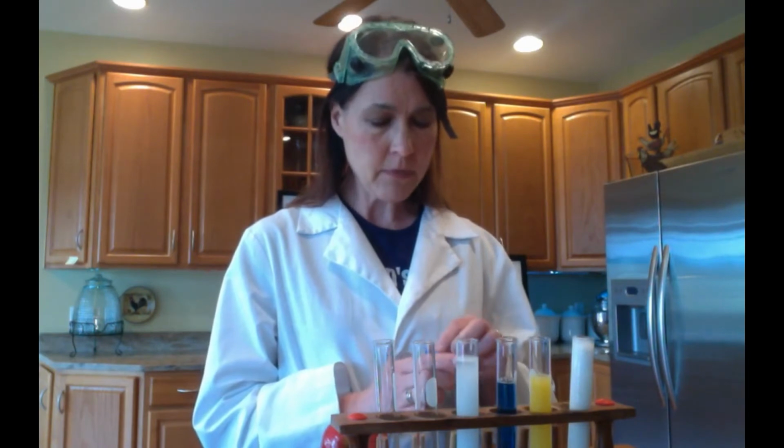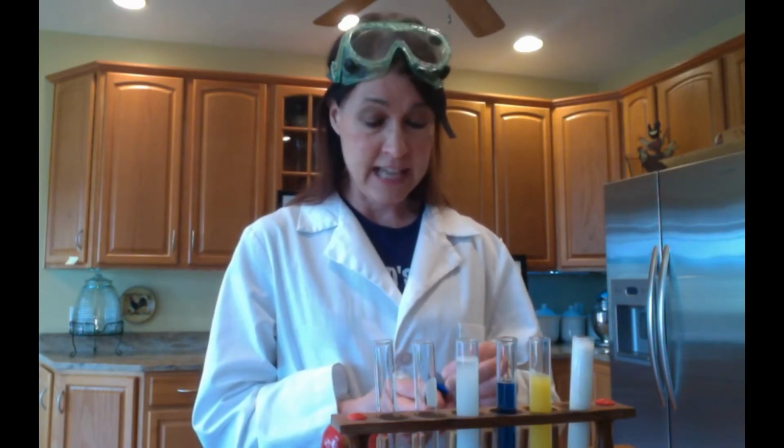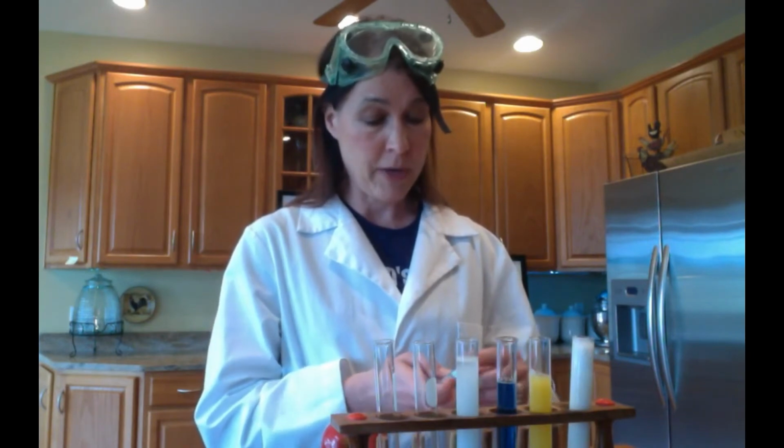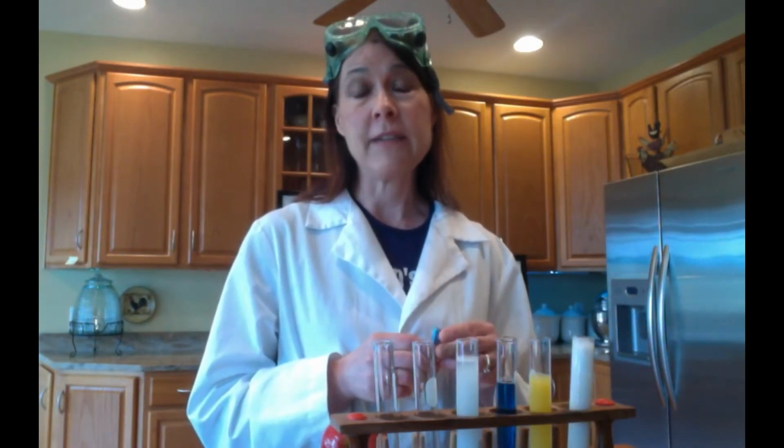So it's kind of dissolved in water, and that dye is then put on filter paper, and it is what we call an indicator. In our next lab, we are going to be looking at a common household indicator that we can make right here in the kitchen that will give us a better idea of how strong an acid is or how strong the base is.